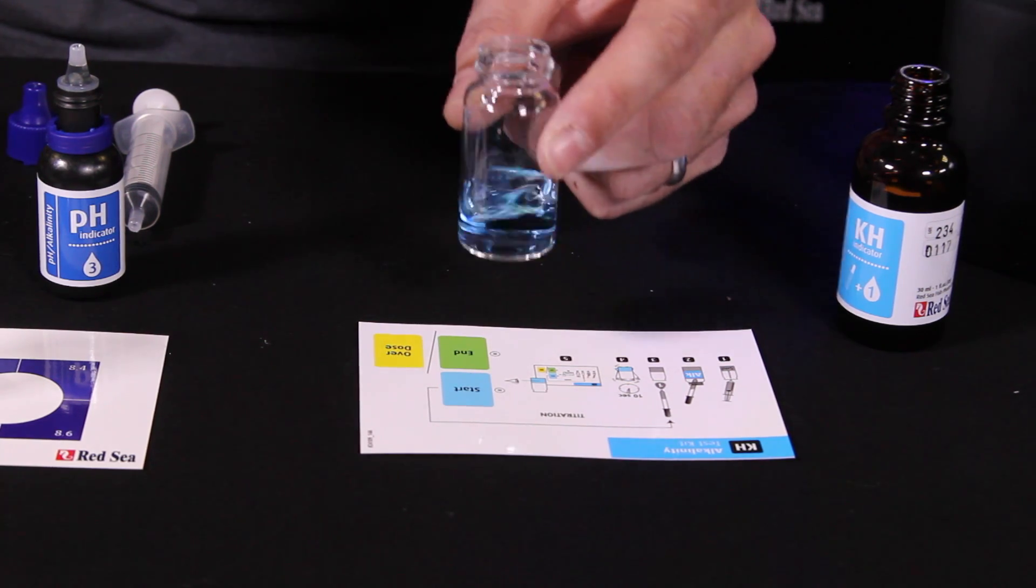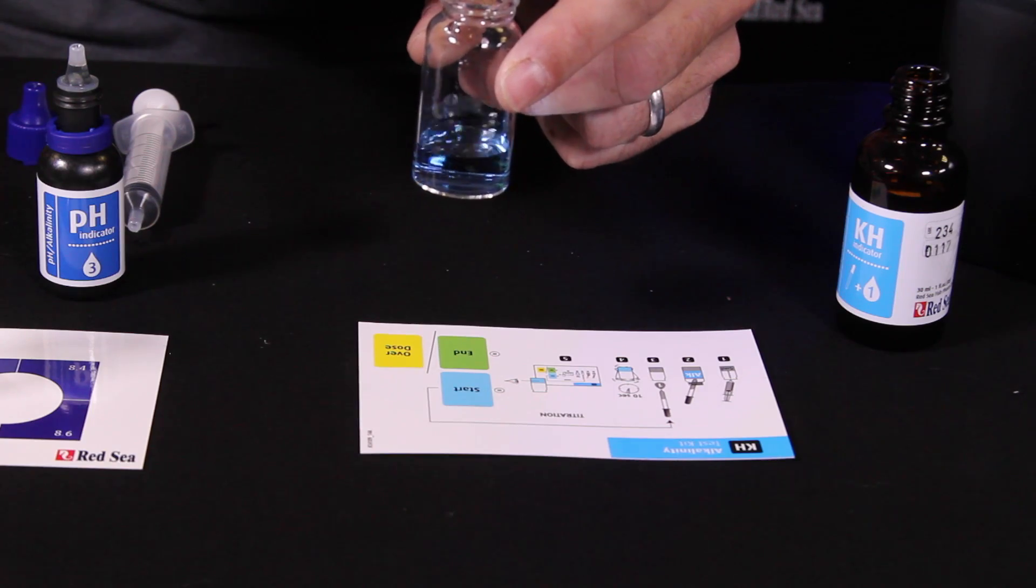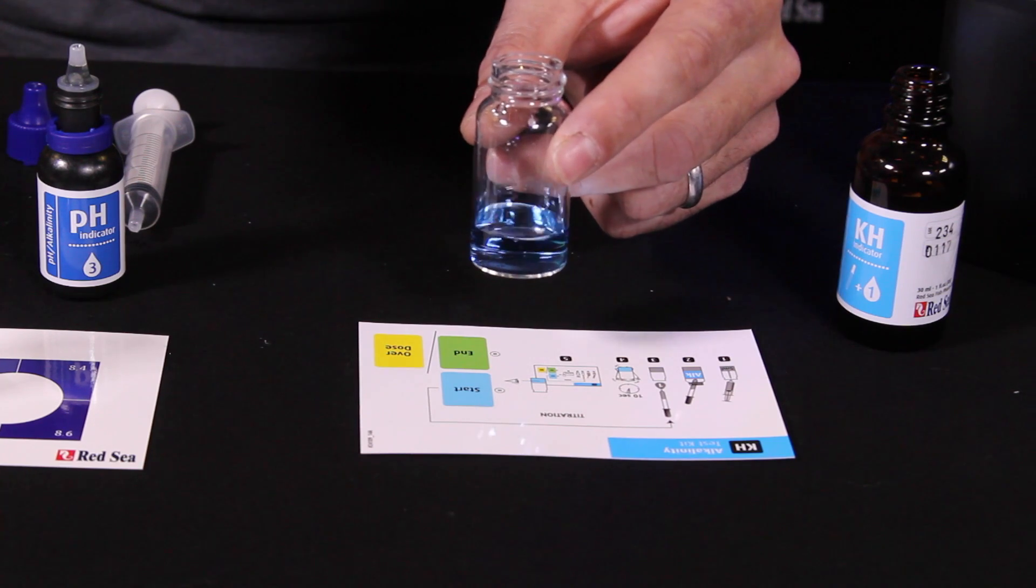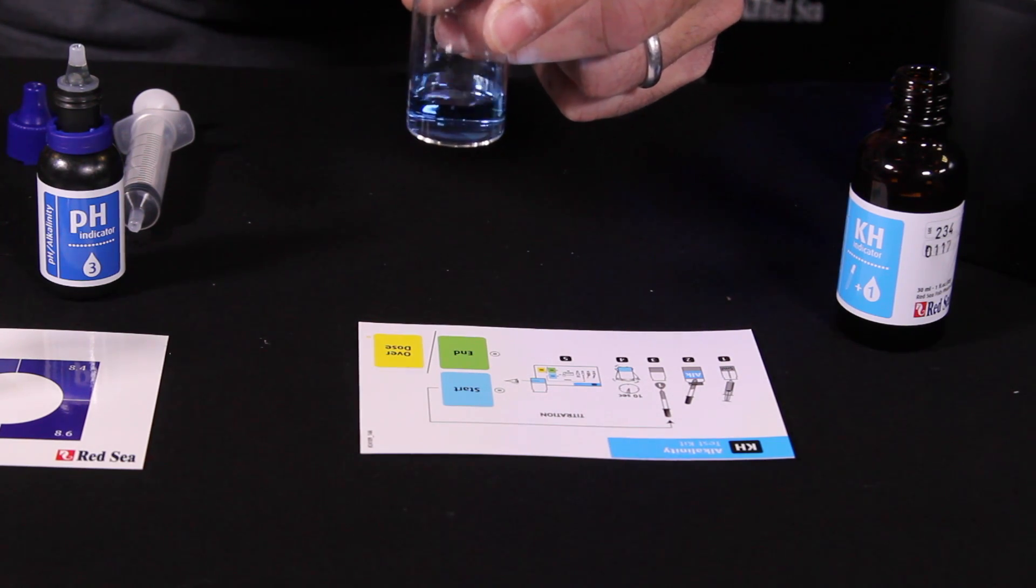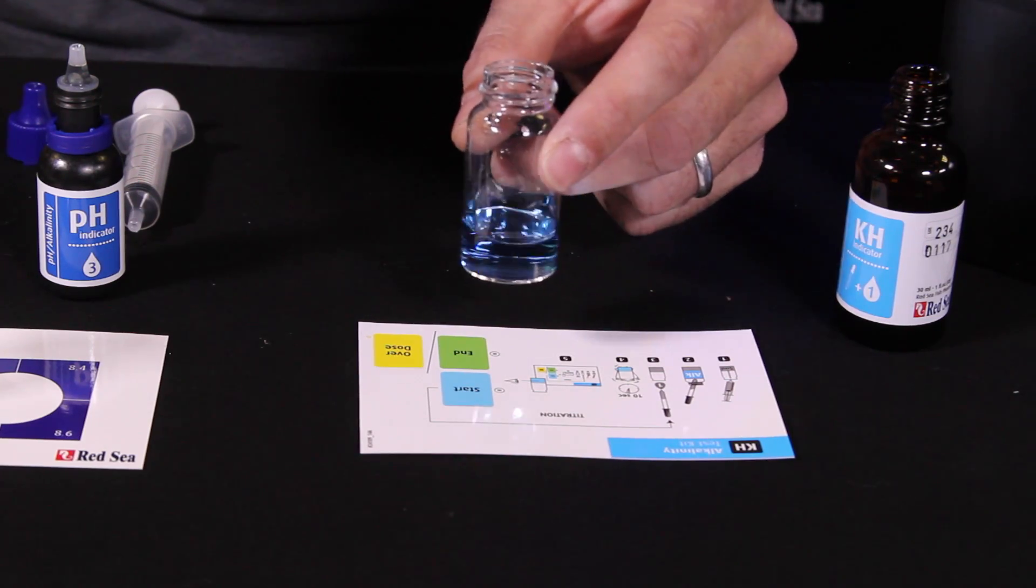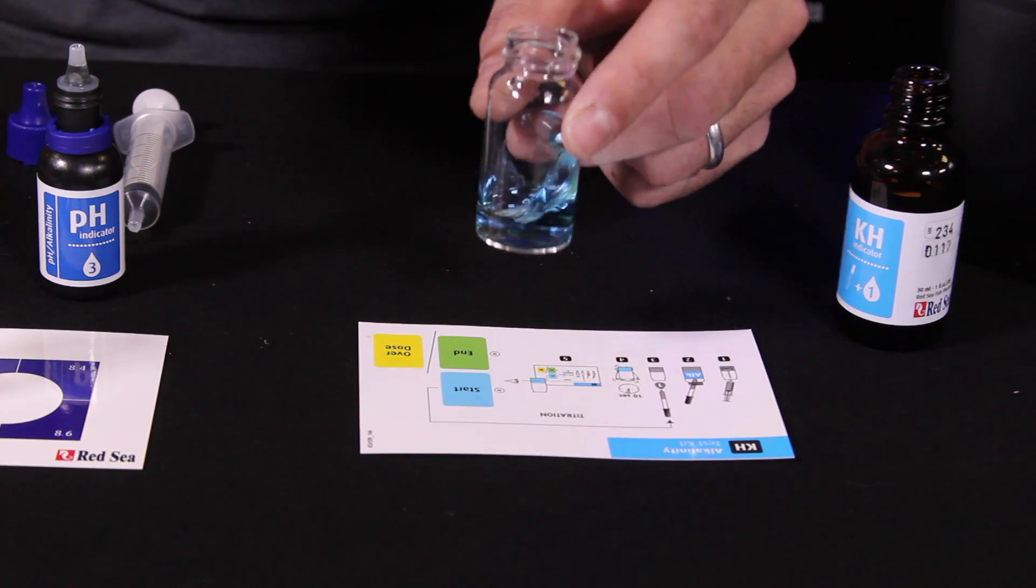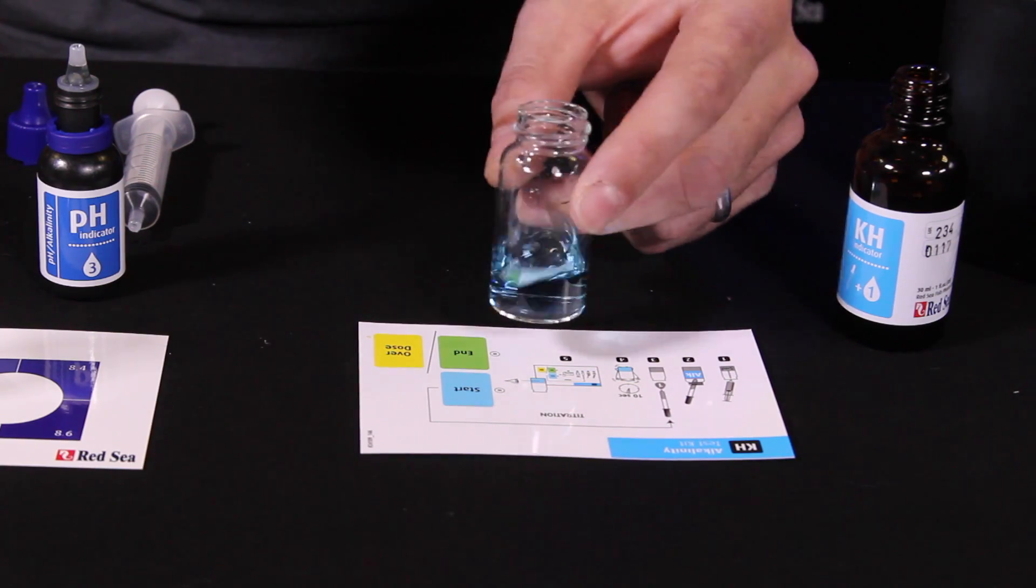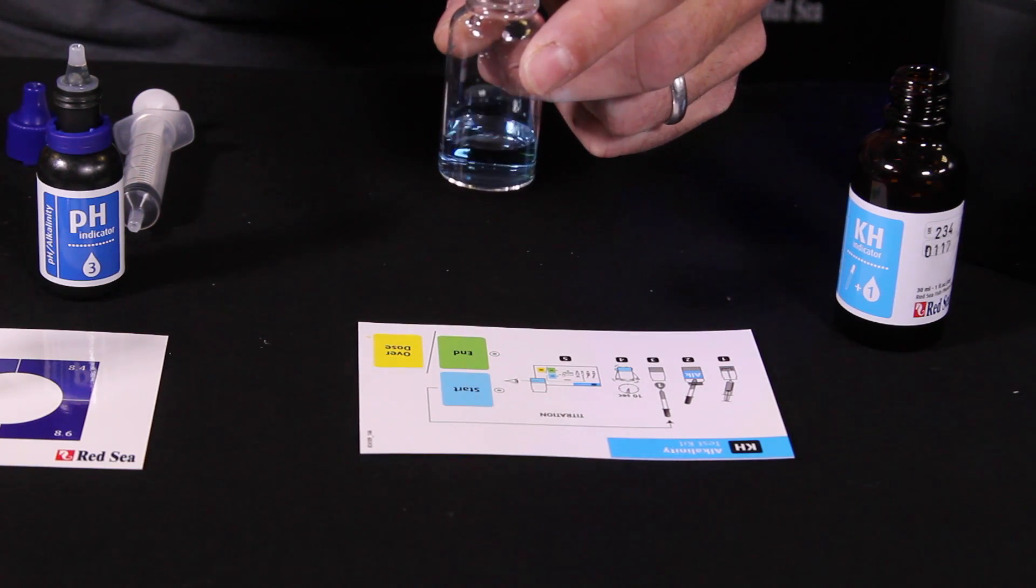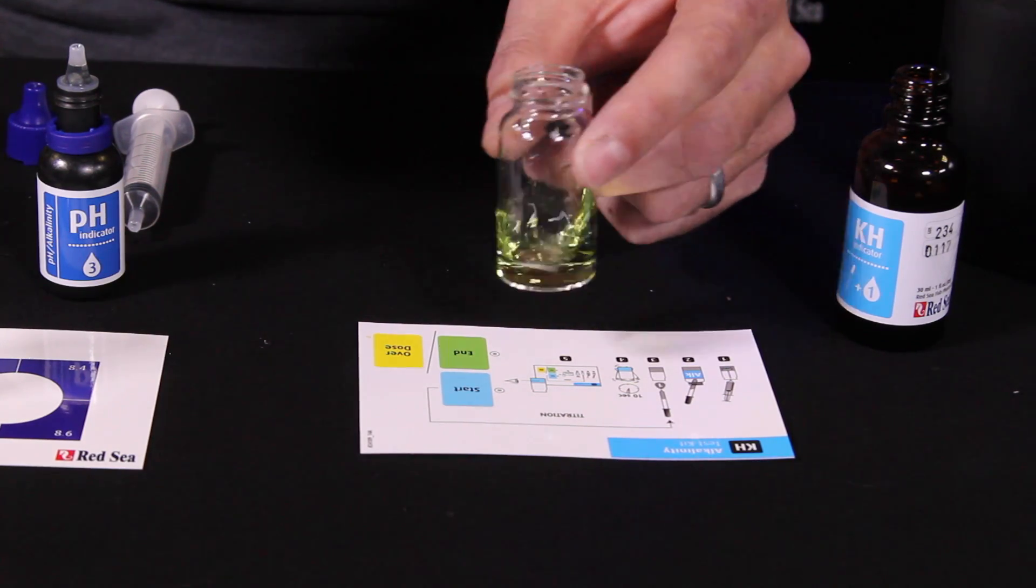Sixth drop. No change yet. Number seven. Still looks blue. Number eight. Still blue. Come on. Number nine. Looks like I'm starting to see it want to go green, but just not yet. Go for number ten. There we have green on the tenth drop.